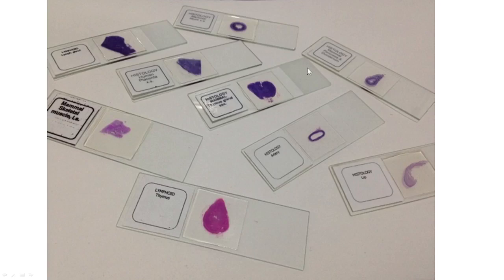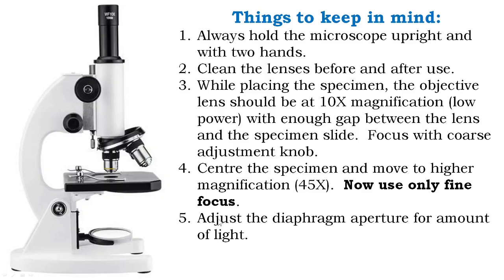So these are specimens. Now see, specimen dige samo khare to glass kanla towa. So you have to be very careful how you handle them. You should not break them. Tadi break che me bai na kiran zuta, so the microscope piche chidu zambala thonan te goya khashe jor.